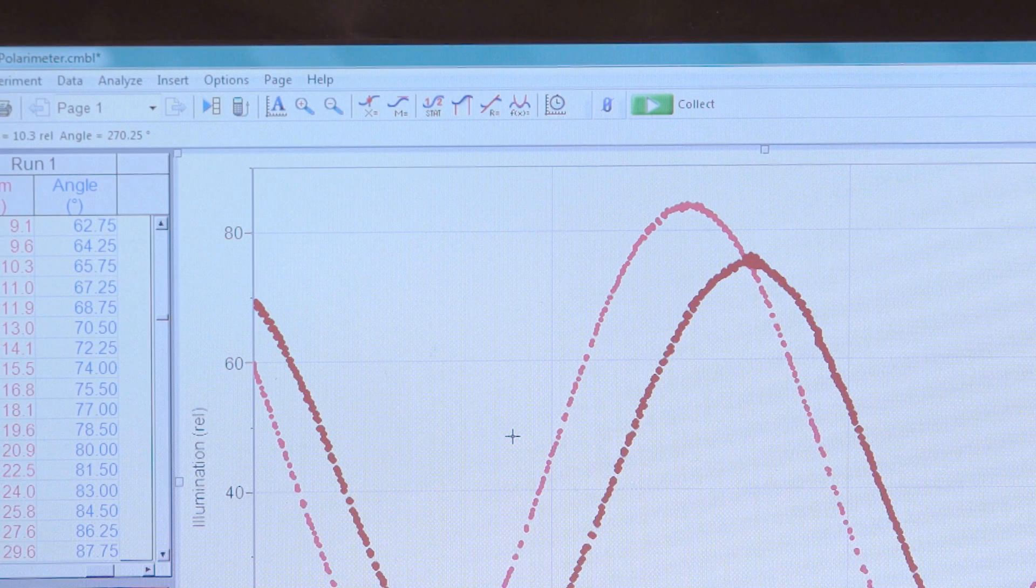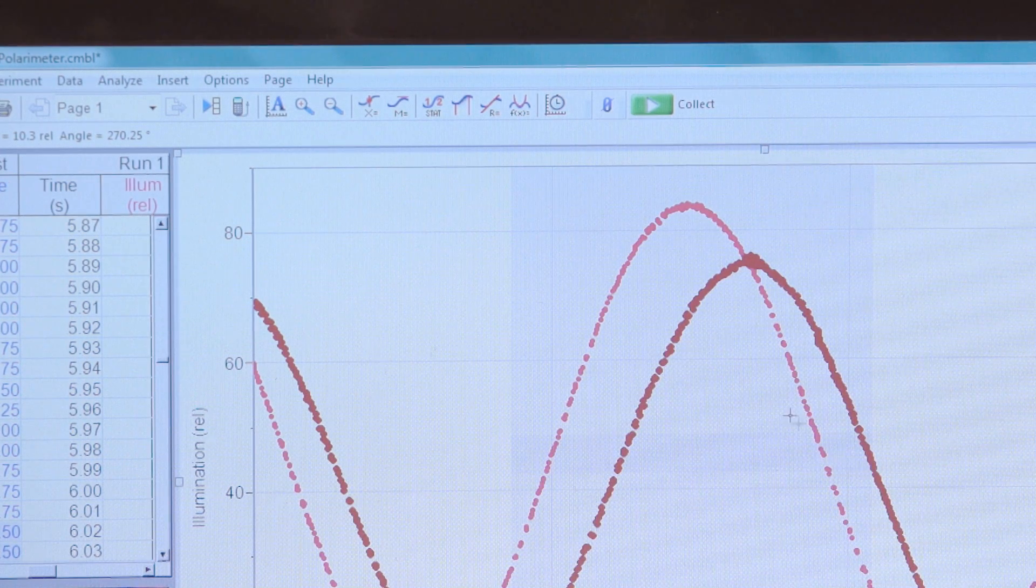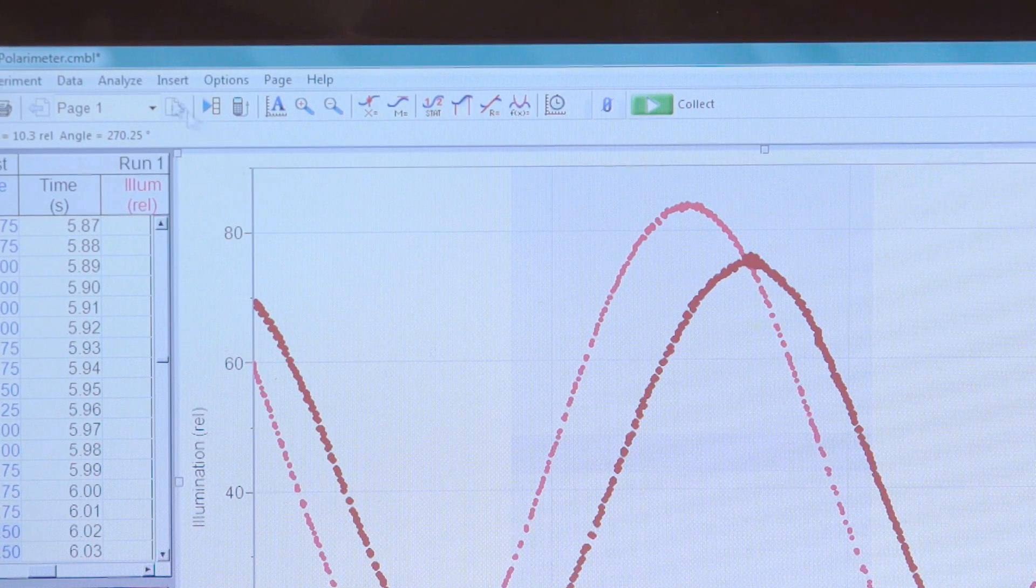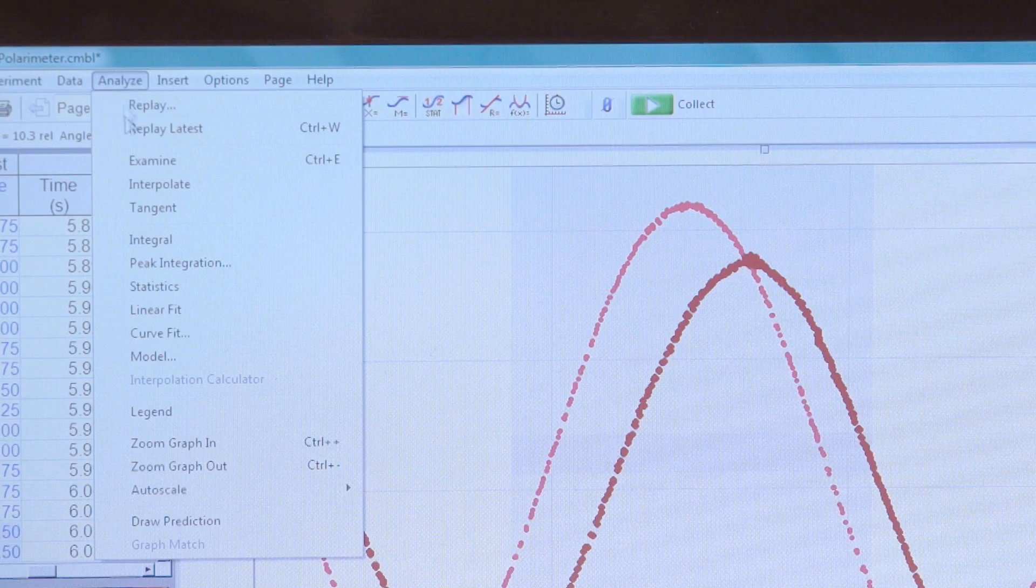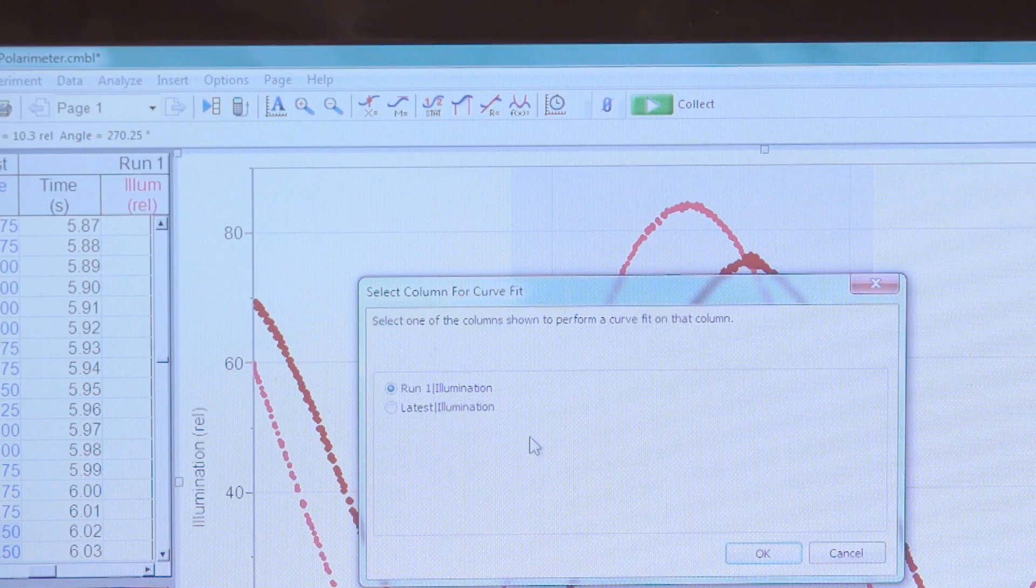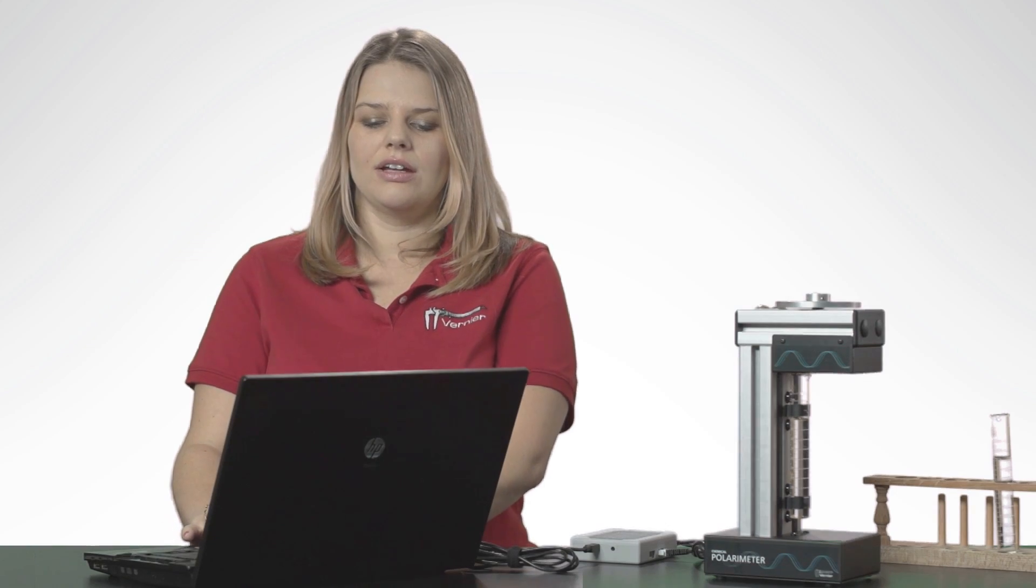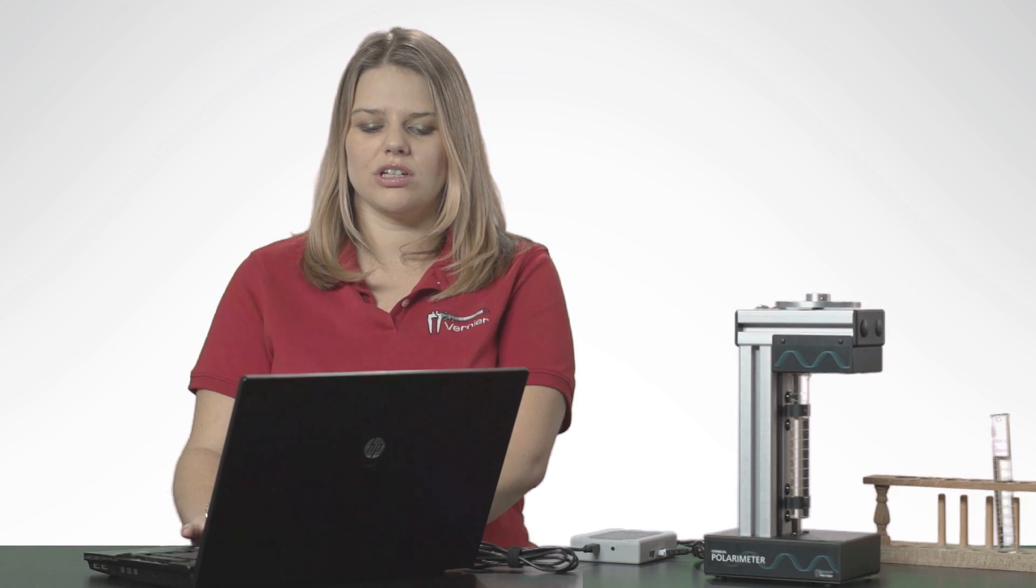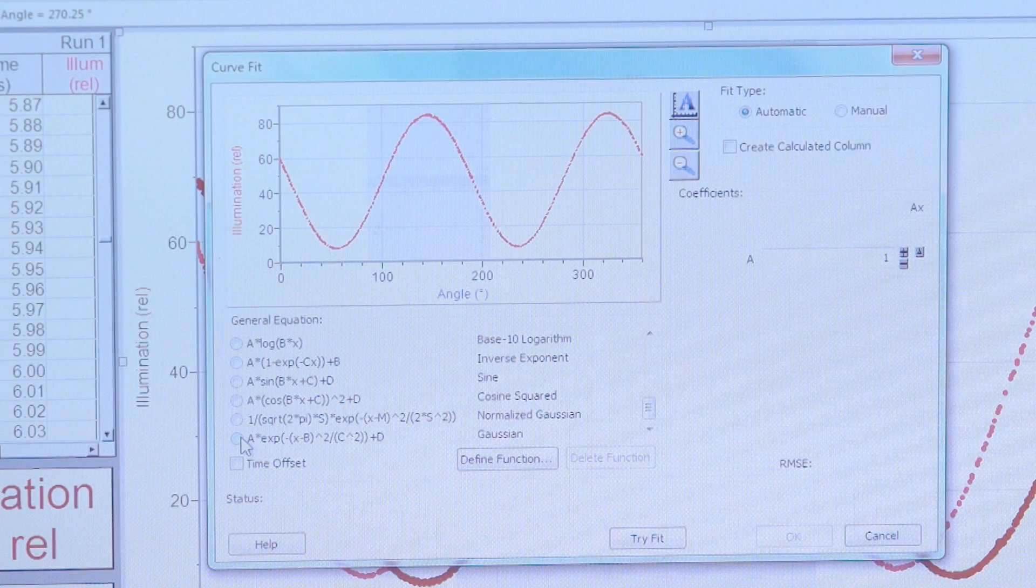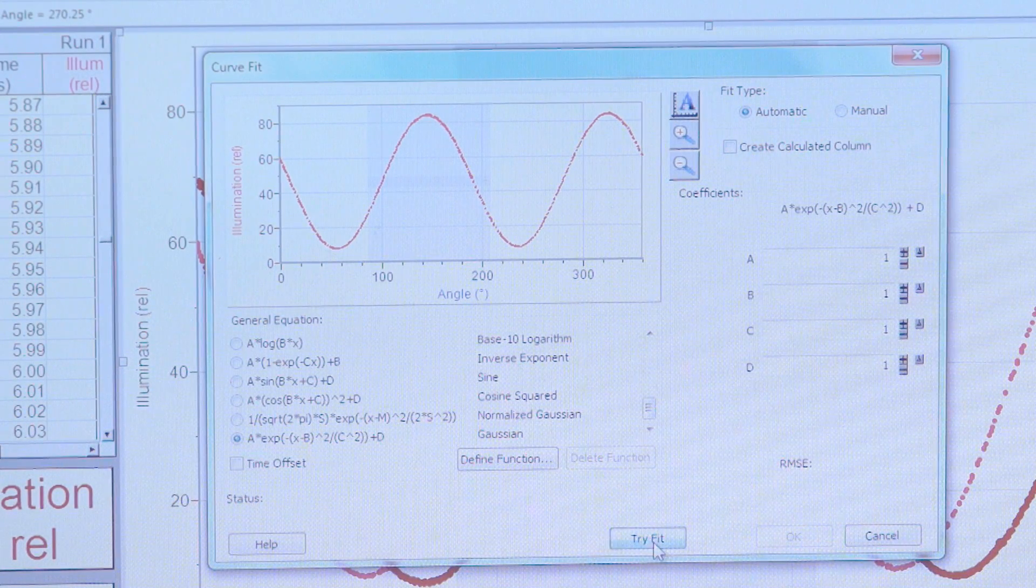First, to do the Gaussian fit, we select a region of one of the curves that's Gaussian-like. Then, from the Analyze menu, we're going to select Curve Fit. Select the blank first, and now scroll down to the bottom of the list of equations and select the Gaussian equation. Then tap on Try Fit.